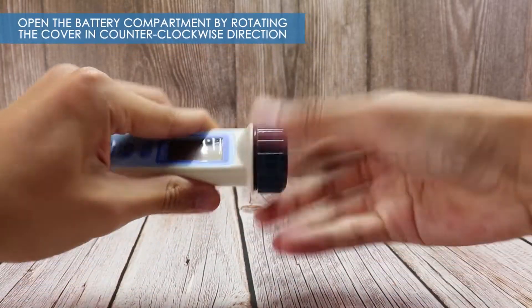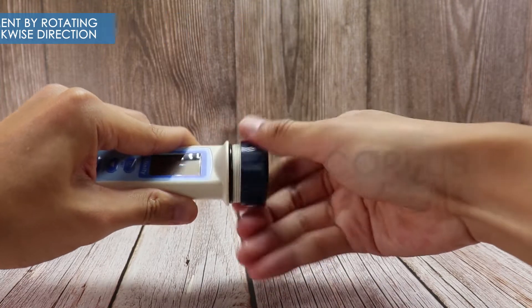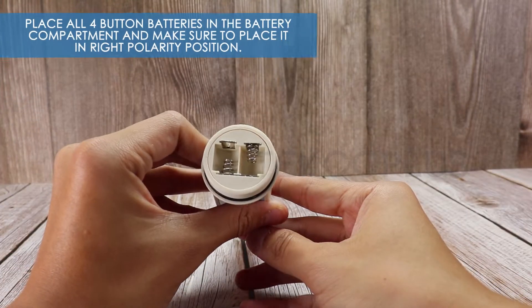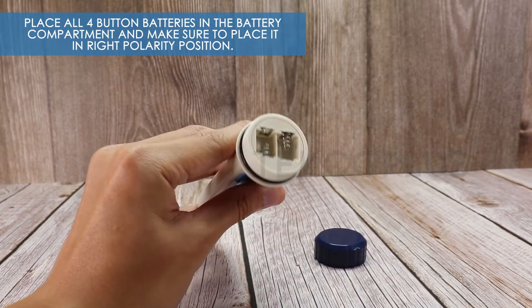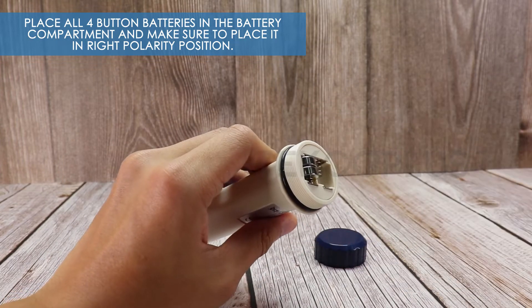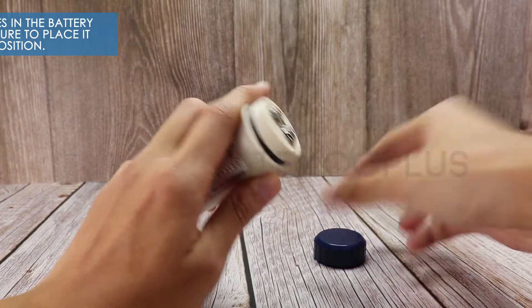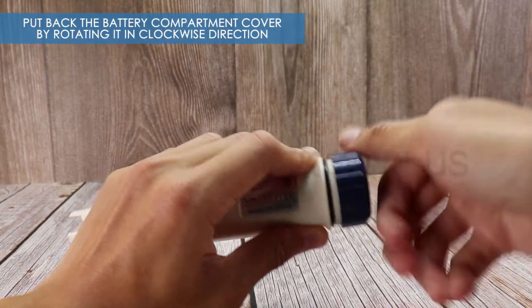To start, open the battery compartment cover. Place all four button batteries in the battery compartment. Make sure to place them in the correct polarity position. Put back the battery compartment cover.